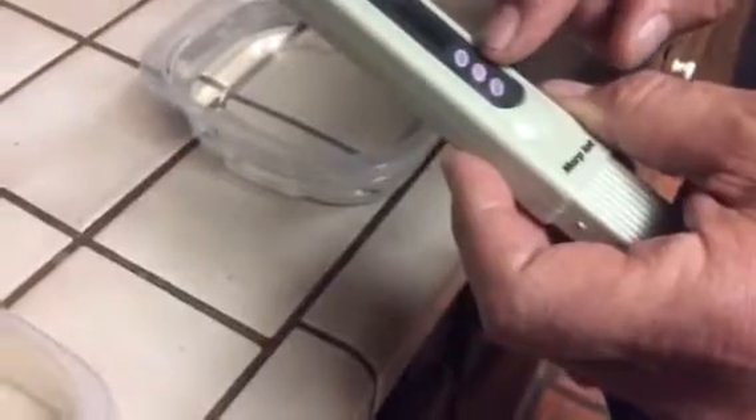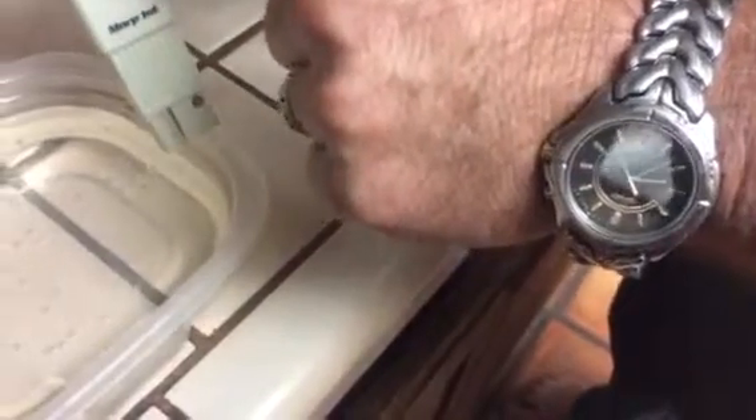So this will do the temperature of the water as well? Well, no — the temperature is a reference, but the temperature adjustment corrects for temperature. Gotcha. Awesome. So easy to read. Take your reading, and when it stabilizes you hit the hold button, and then you can take it out and get a good read.